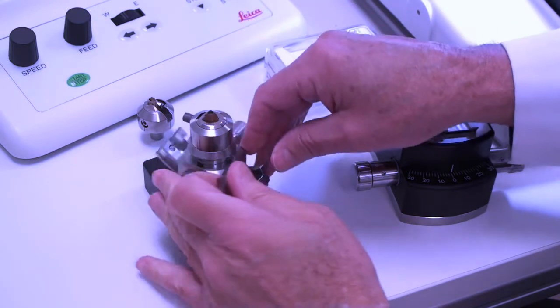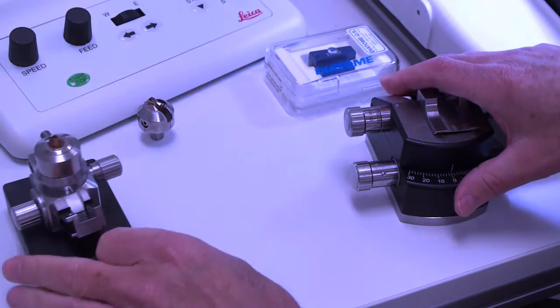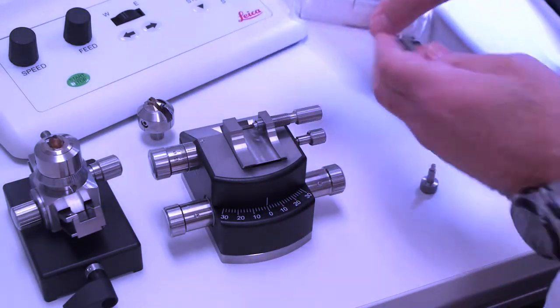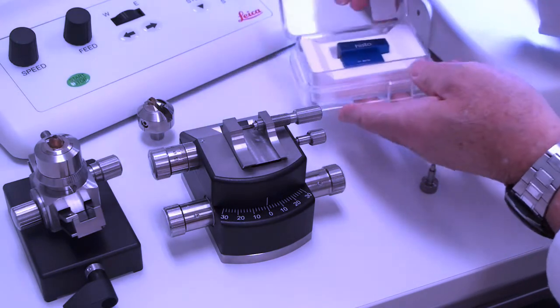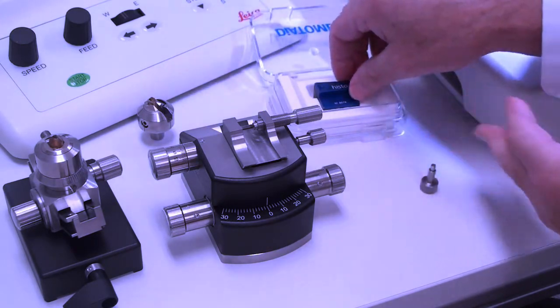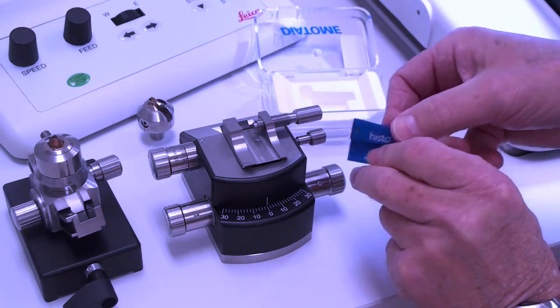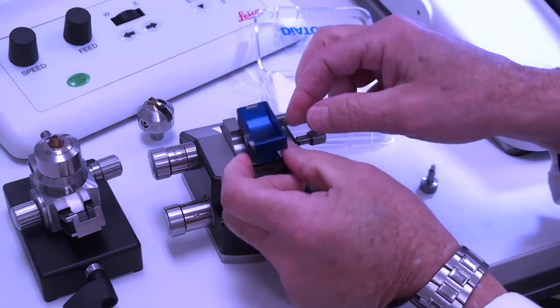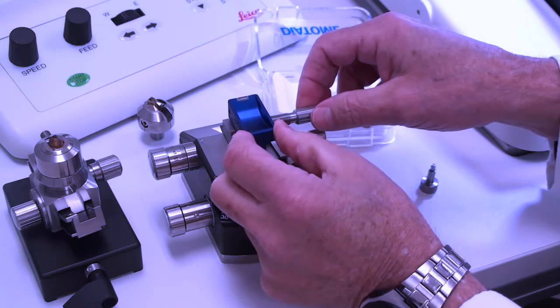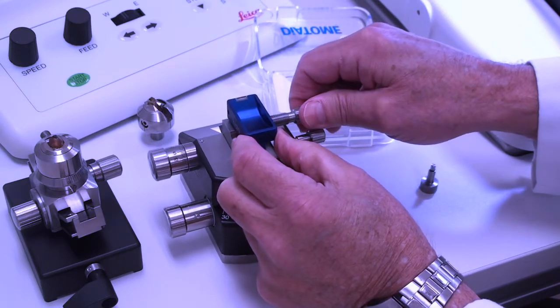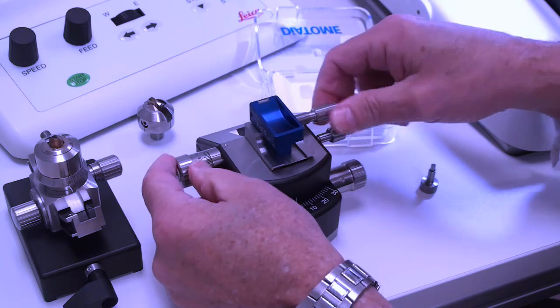So our sample is all ready to go, and now we're going to load our knife. When you handle diamond knives, be sure to never touch the knife itself, the blade. So always be careful and hold it from the sides and the back. As I load that, I want to make sure that goes all the way forward so that it's flush against the front. Again, nice and tight.